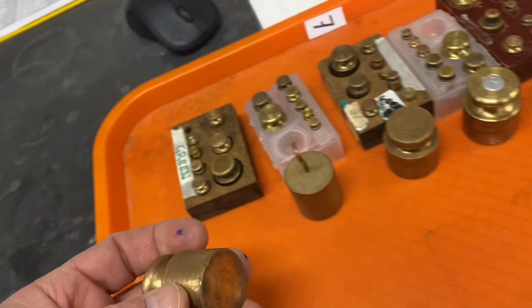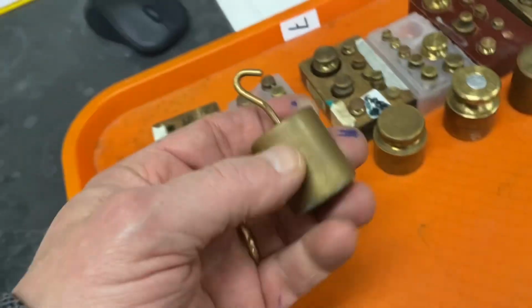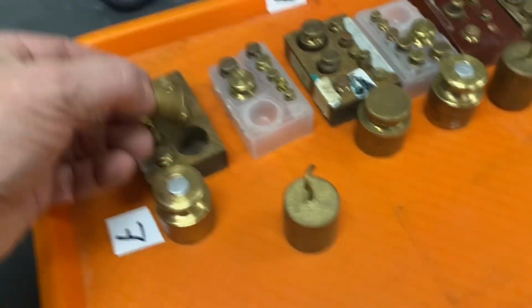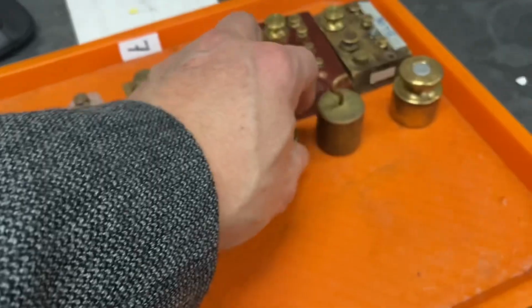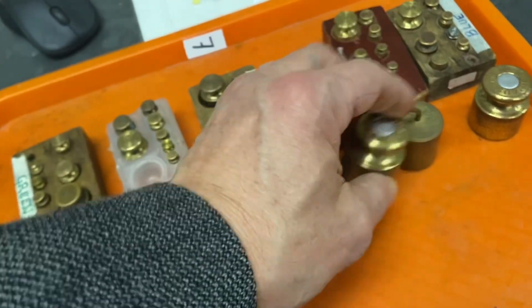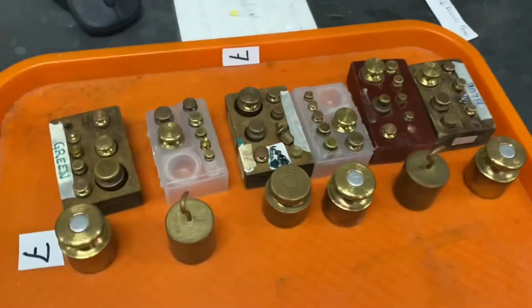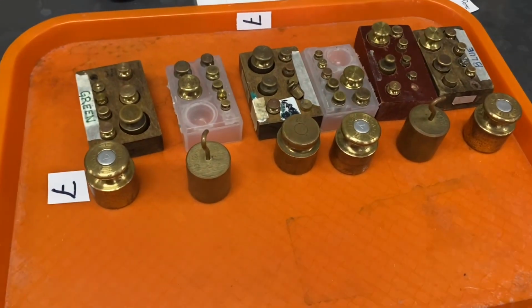For part 3, it actually might be interesting to find the density of one of these. We know the mass, so that should be easy, but that could be something someone tries. These would need the overflow can probably to do. These smaller ones wouldn't. I don't want you to force or jam anything, so be careful with the material so you don't break it. So good luck, and I hope you have some fun with it.